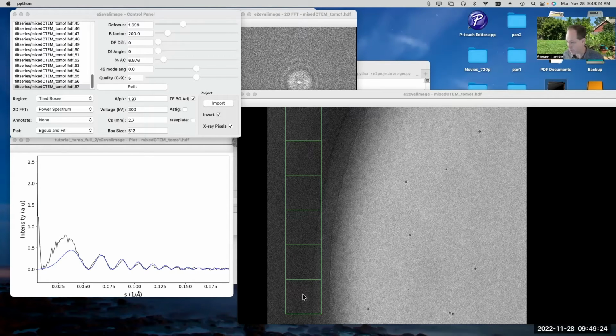And if your reconstruction geometry is known and correct, then your knowledge of that should be correct as well. If you get the tilt axis off by 180 degrees, then your assumption is going to be that it's tilting in the wrong direction.